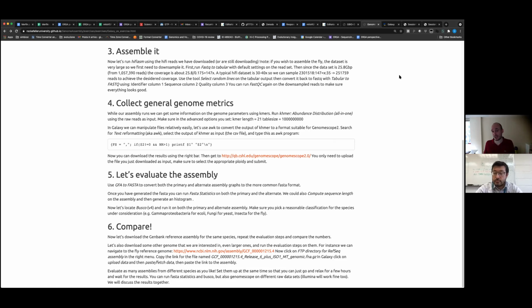It's very, very efficient, so it's close to compiled software. It's not, because of course the original file is a plain text file that you're trying to manipulate. But in terms of speed, it's really, really close to that. That's why it's so popular.